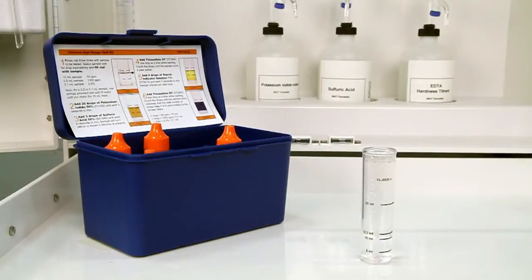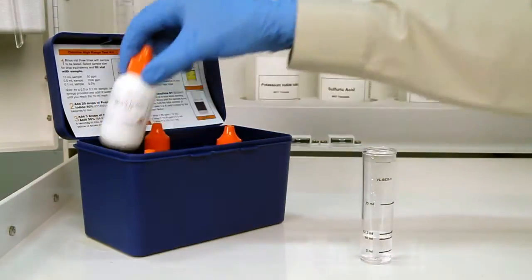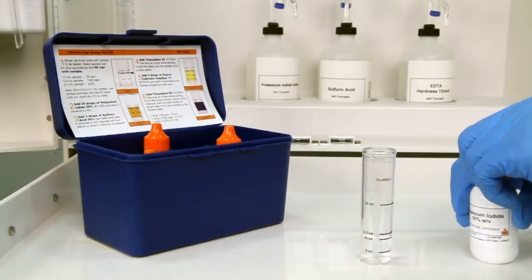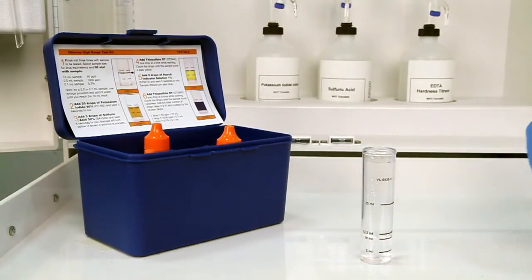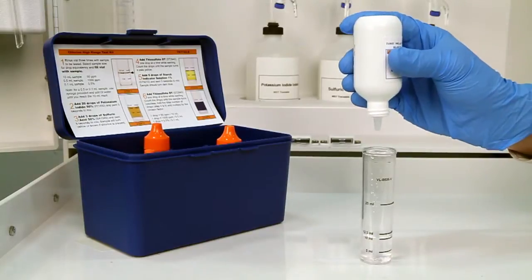Once you have collected an accurate sample, the next step is to add 20 drops of potassium iodide 50%. The bottle contains a dropper tip, so it's important to hold the bottle vertically to get a consistent drop size.